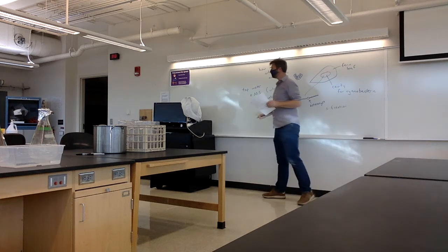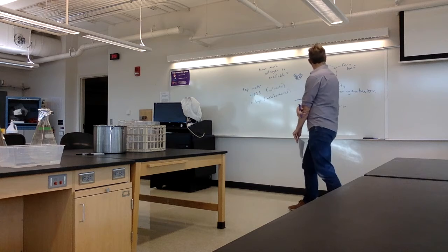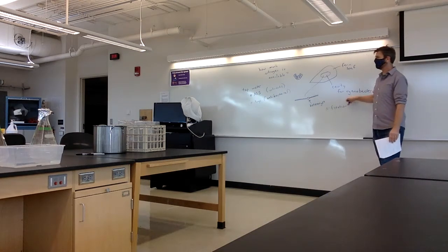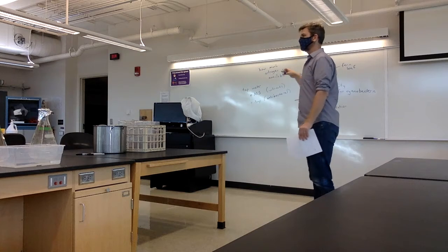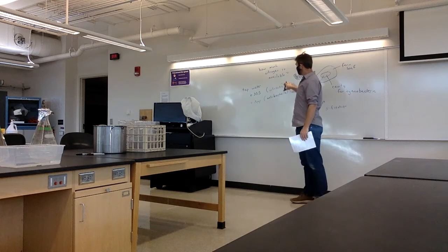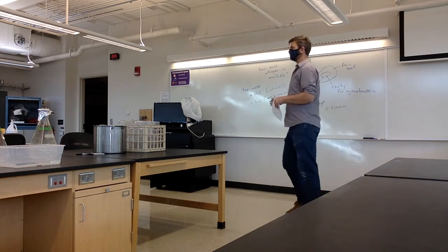So, what in the world would this do for us? Control the bacteria? All right, so my hypothesis here is this might have an effect on the abundance of the cyanobacteria. So with that addition, I'm hoping to actually kill out the cyanobacteria, or maybe at least inhibit them a little bit. So we have basically the addition of outside nutrients, and then the antibacterial or antibiotic chemical might knock down the plant's ability to make its own nutrients.